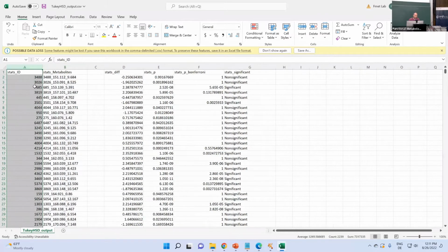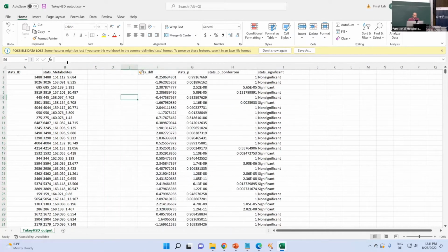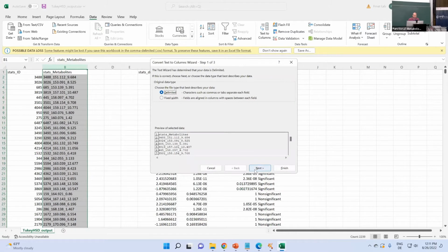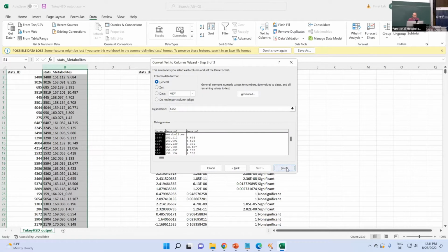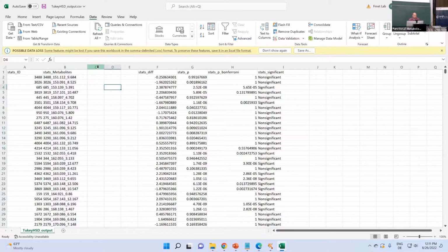So if there would not be a column like this, the same way as with Sirius, I could also split that other one. Yeah, can you quickly show again how to split that? Yeah. So I just click on it and then go to Data and then Text to Columns and then select underscore as a delimiter. And then it just splits it. That's very convenient with Excel.